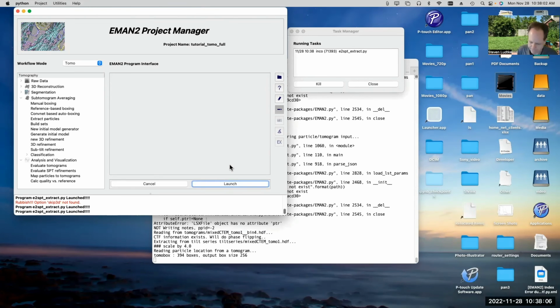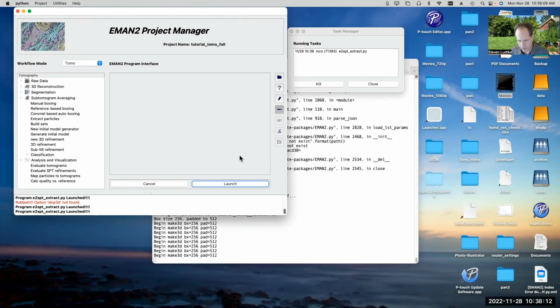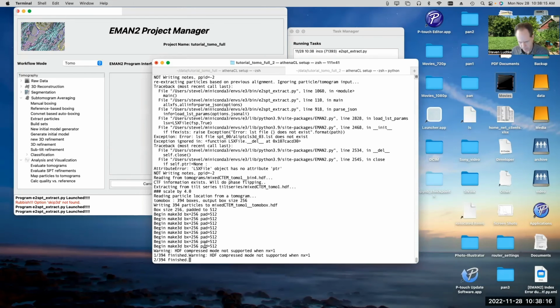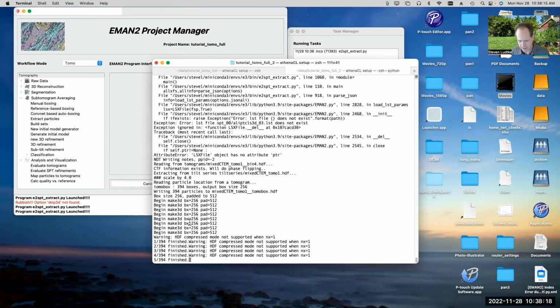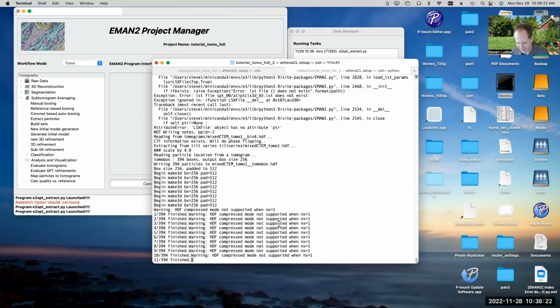Ah, much better. Okay, there we go. Oh, and it looks like it's not skipping 3D. Either that or it's okay. It is skipping it. It's just printing the message out anyway.